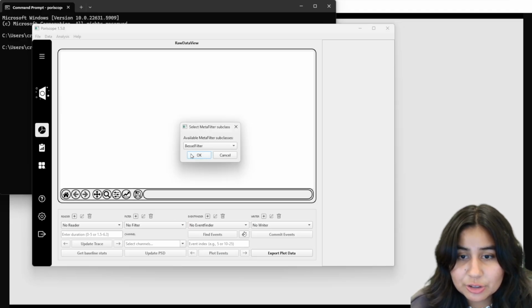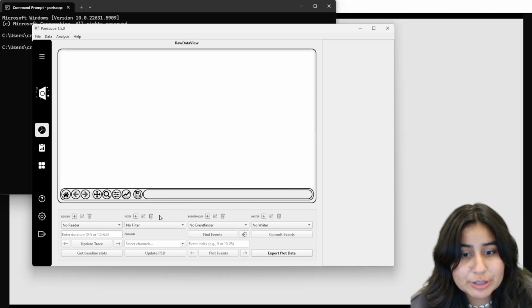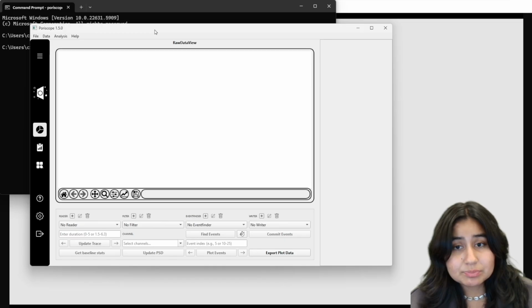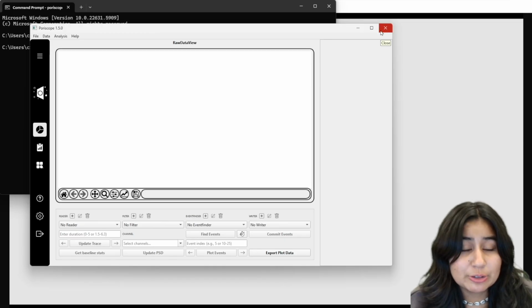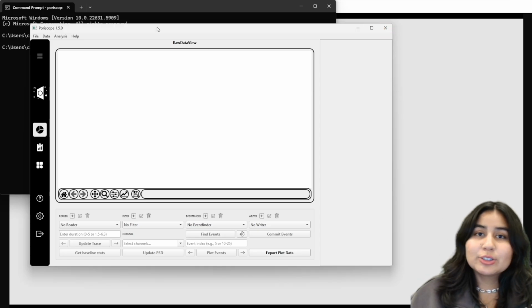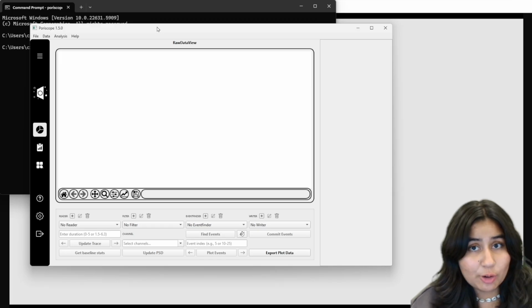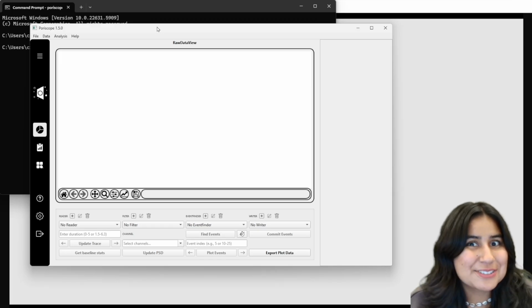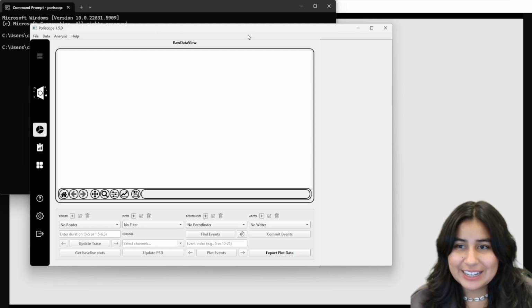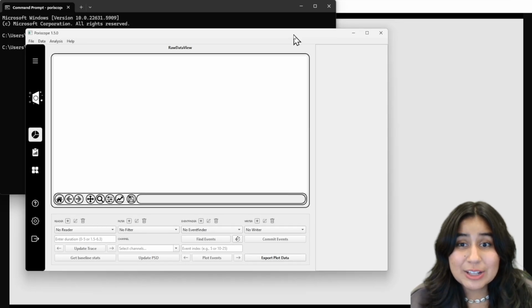If I was to create another one and then close it there, it will restore it, but just a reminder that if ever you accidentally close your window and you wanna restore it, you have to restore it right away, otherwise it will not work. But that's why the restore sessions should be used as a fallback rather than as your way of saving your progress. You should not be saying, okay, I'm done for the day, I'm going to close this window and then come the day after and click restore. Because again, it should be a fallback.